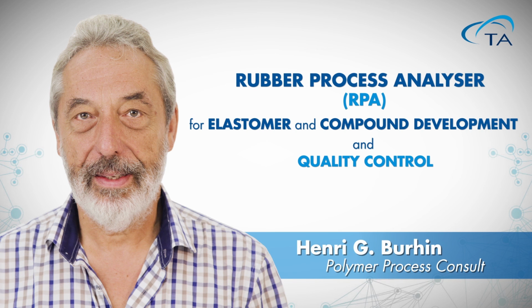But it is true that by going to high strain, LAOS conditions, you remove the effect of filler-filler interaction. And if everything is constant, polymer, quantity of filler, and so on, then you may see a difference in interaction between filler and polymer.